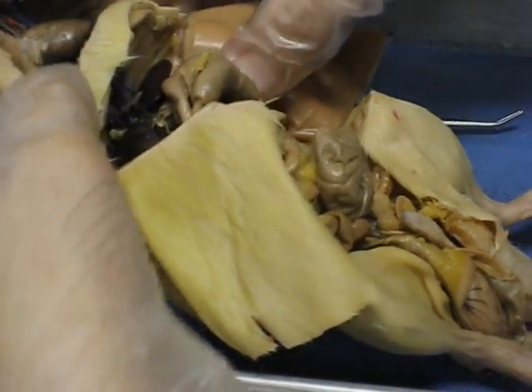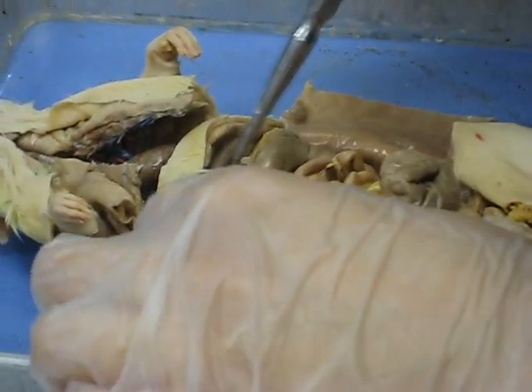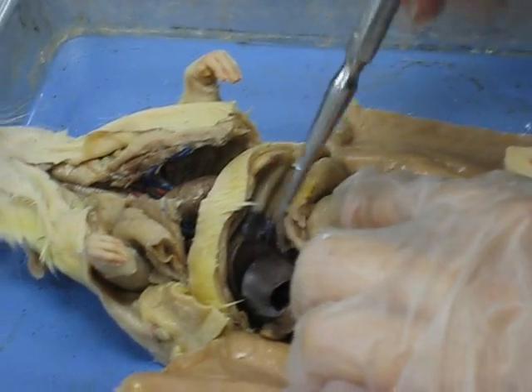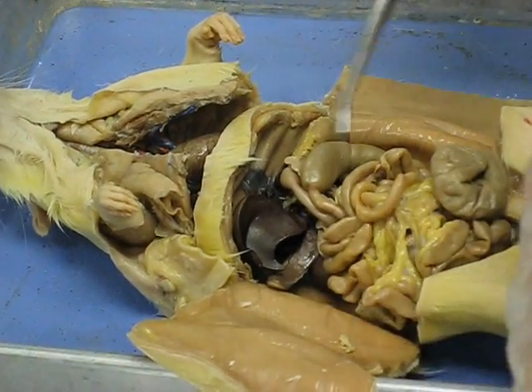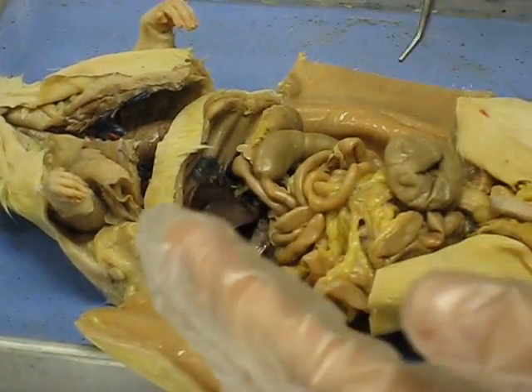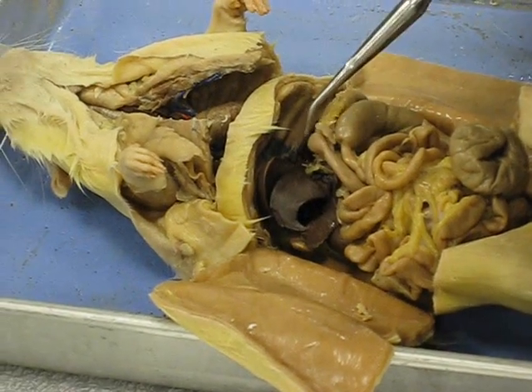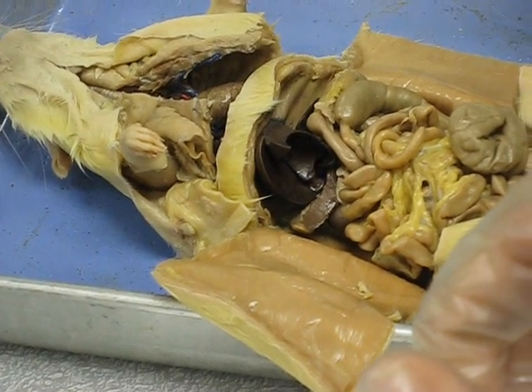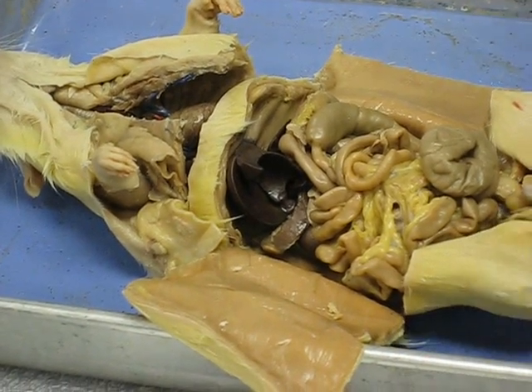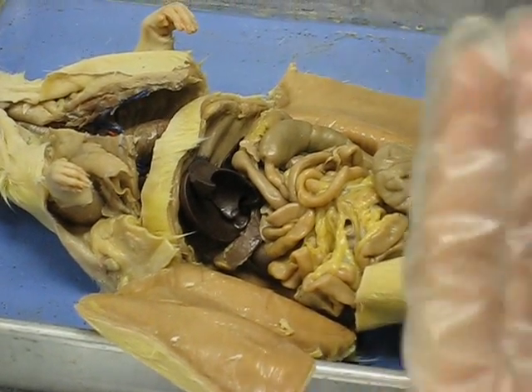So then we come into the abdominal region. First things first — what is all this dark? The liver. Yeah, it's the liver. These are the lobes of the liver — a lot of lobes. When you open yours up, that's what you first saw. Are there a definite number of lobes or can it vary? I'm not too sure — there probably is a common number, but there's always variation.